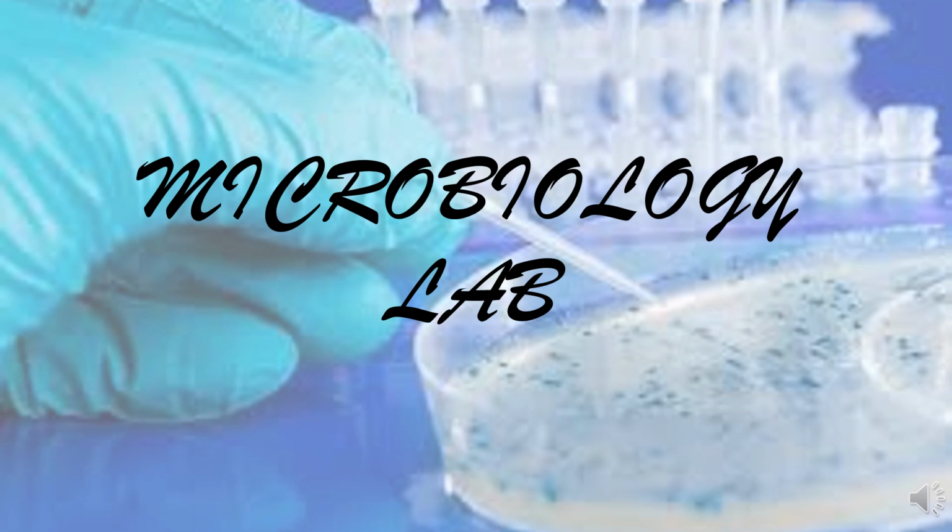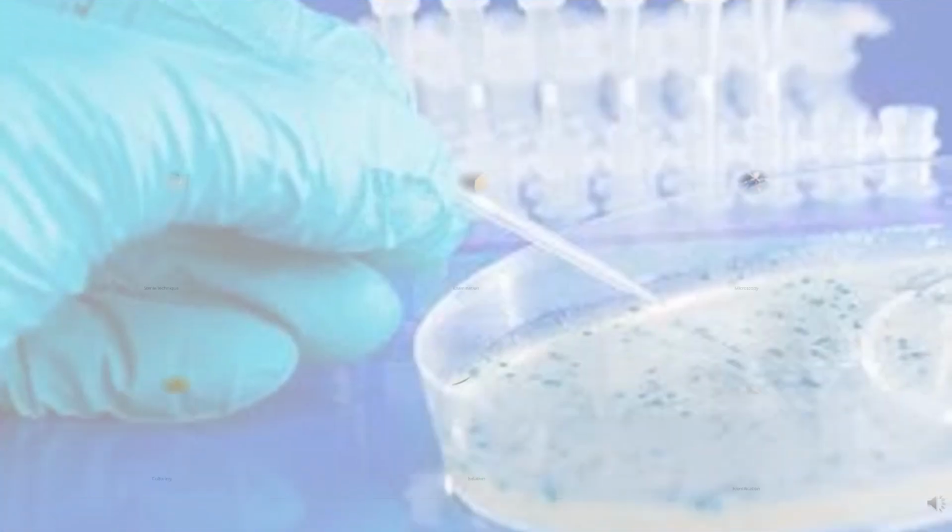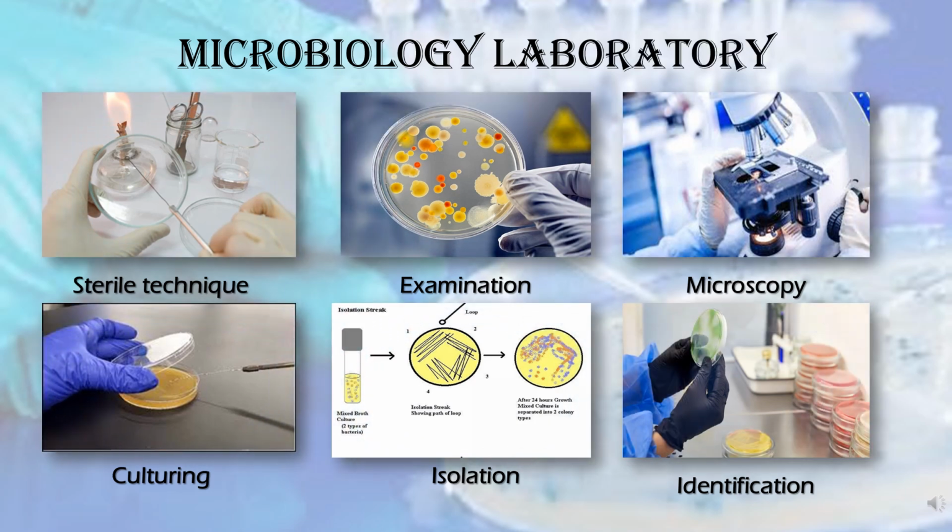Today we are going to learn about microbiology laboratories, techniques, key activities in microbiology laboratories, and good microbiological practice. A microbiology laboratory is a laboratory devoted to identifying microorganisms including bacteria, fungi, yeasts, parasites, etc. The microbiology laboratory has a crucial role in effective infection prevention and control. This lab covers basic concepts of microbiology with an emphasis on sterile technique, examination, microscopy, culturing, isolating and identification of microorganisms.